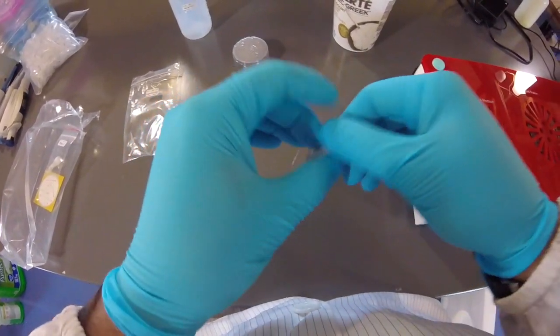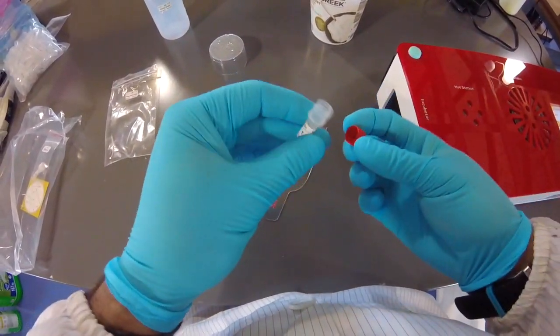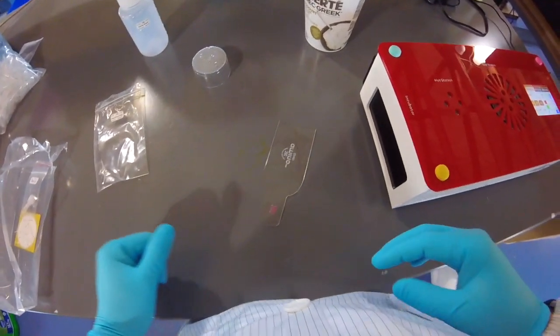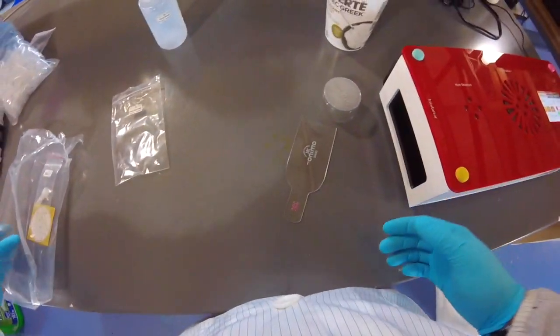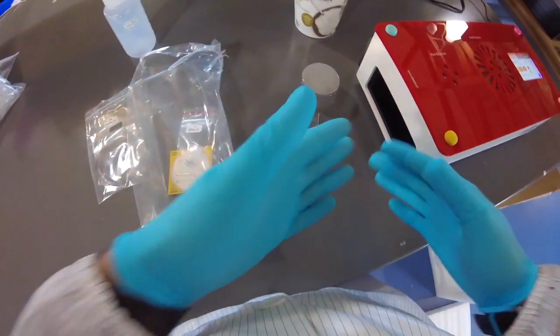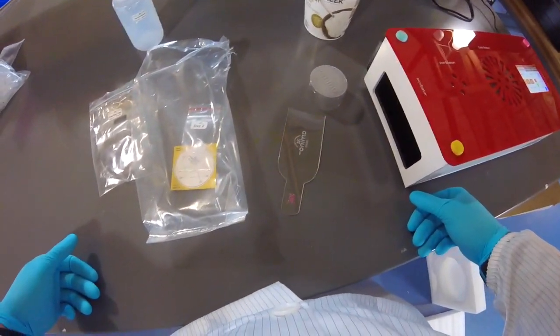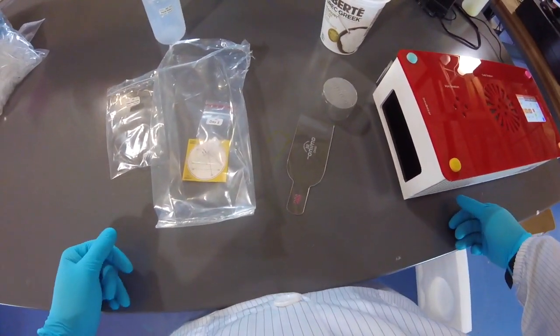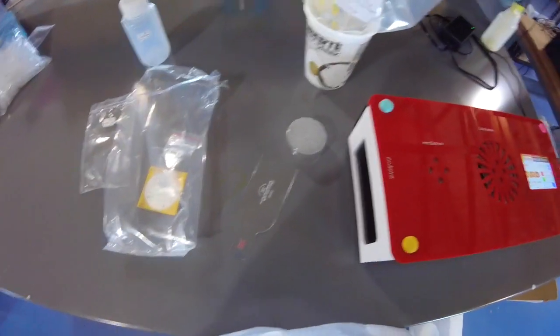Okay, but now that I got a lot of colonies, the experiment looked like it went quite well. I'm just going to take the lid off and put it into my inactivation bag. Okay, we're basically done here. We're going to let these incubate a little bit longer. Always remember to take pictures of your plate so that you can log your journey as you go. And we'll leave it there for another 24 hours.